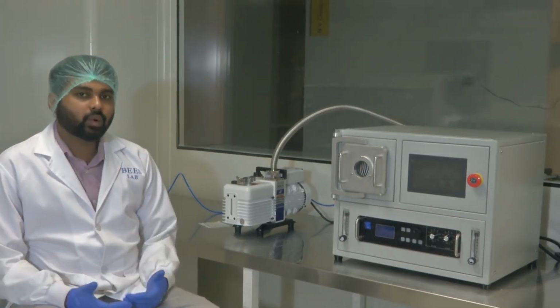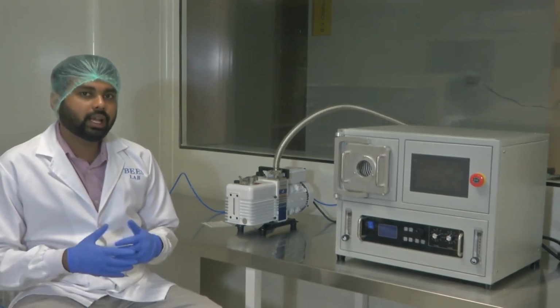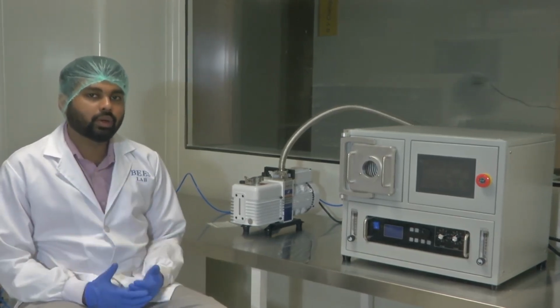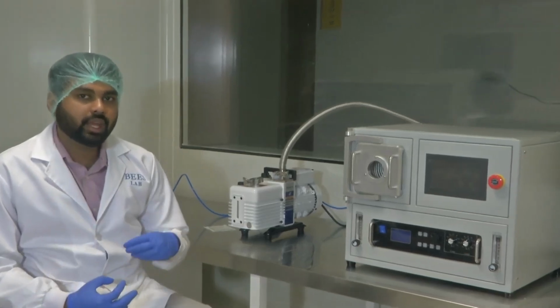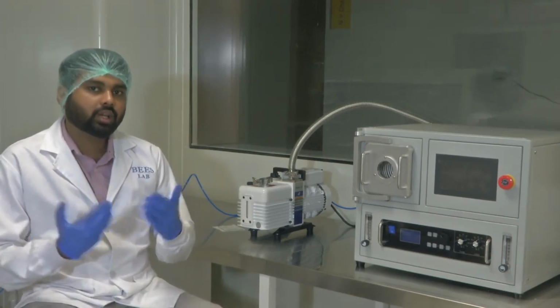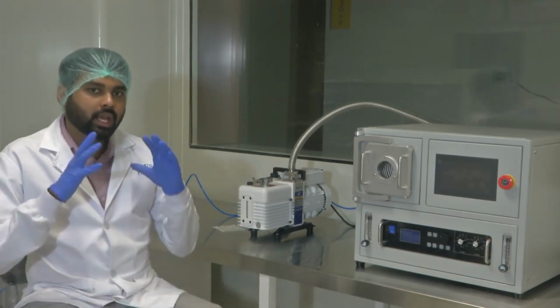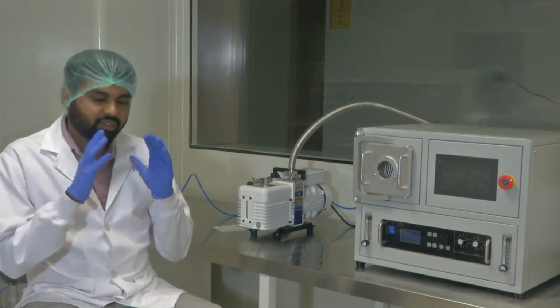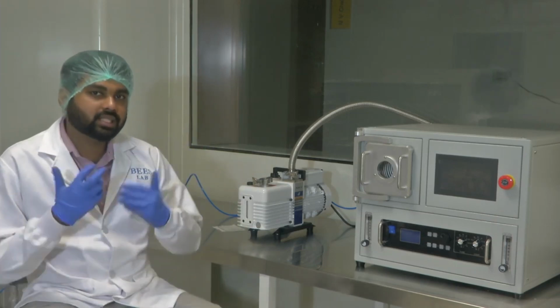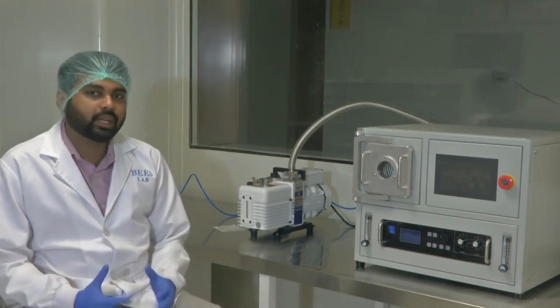When I say ionized, what it means is that the potential is so high that the electrons in the molecule, the electronic cloud in the molecule, gain enough energy to escape the attraction of the nucleus, and they enter the common space between the molecules, and thus the whole confined volume of the gaseous mixture gets charged with ions and electrons.